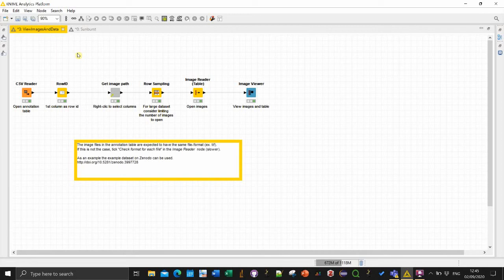So in this tutorial I want to present you two workflows that I propose for the analysis from the annotation table.